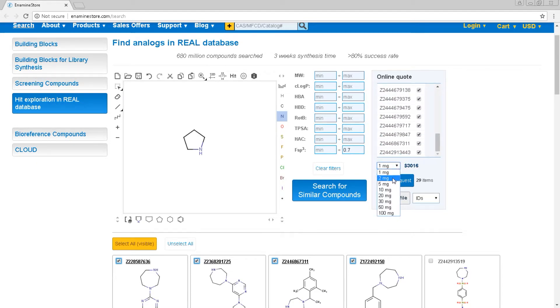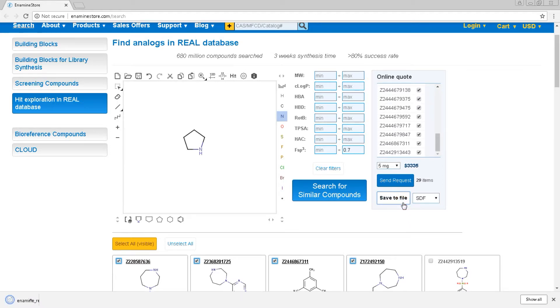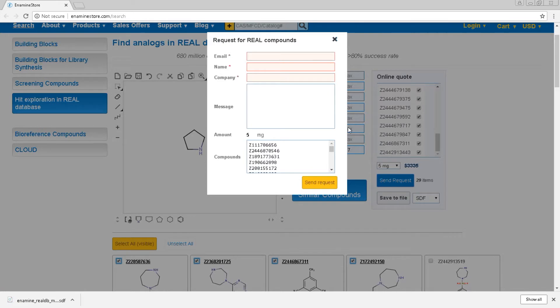Then you can pick the amounts you need. Here you can save the whole list of compounds selected in various file formats, or you can request an online quotation.